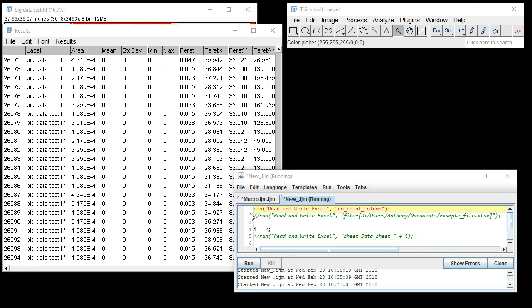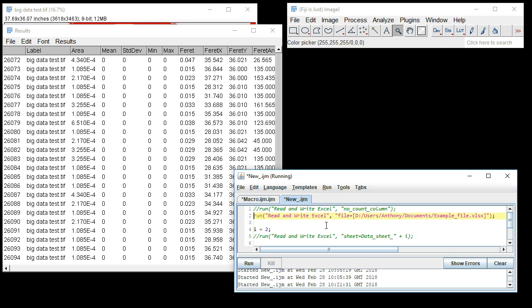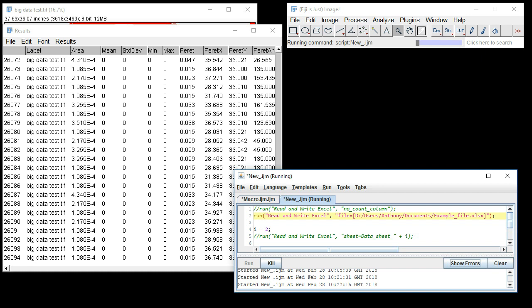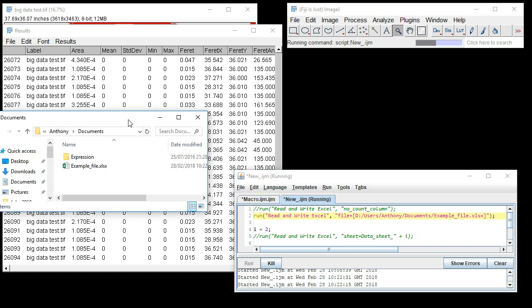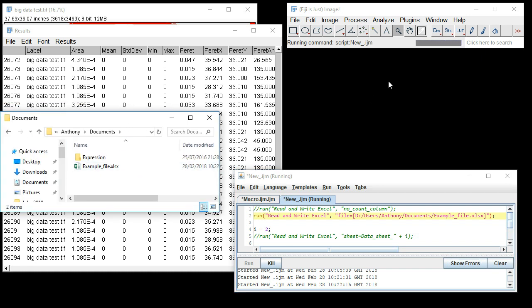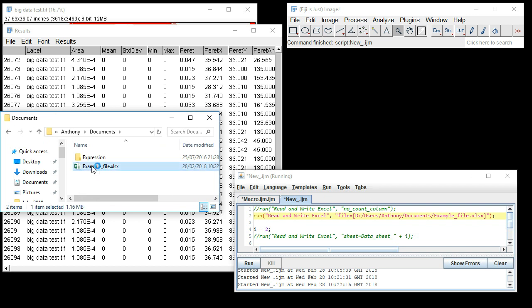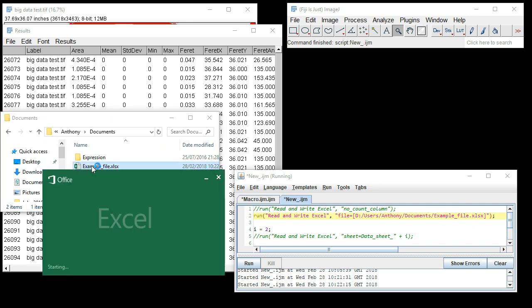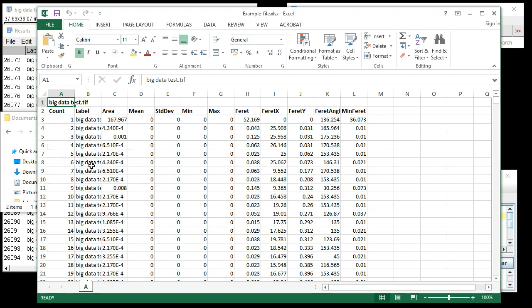I'll show you the next optional argument feature that's been added by Brendan Cromhout, which is a custom file path and file name feature. You can see how it's implemented here. By running this, you can see that in this custom location the export is done. Our file has been created, and all data points are present in the correctly formatted data type.